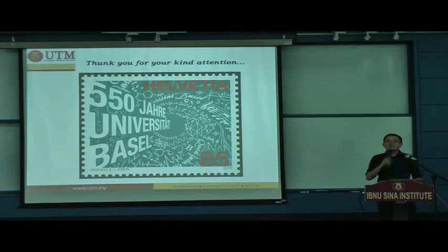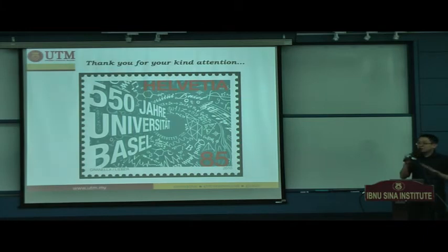So, about the reproducibility of the membrane: definitely we try to reproduce the results by preparing a series of the same membranes for our extractions, and I showed some of the results.